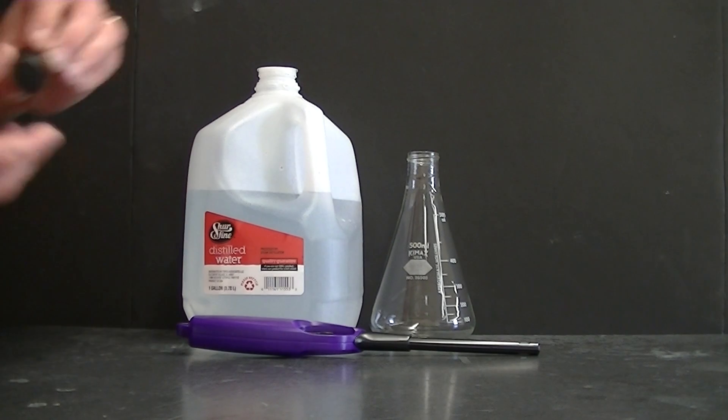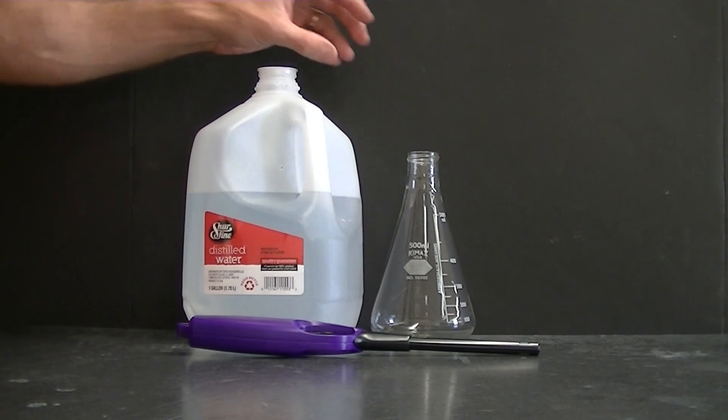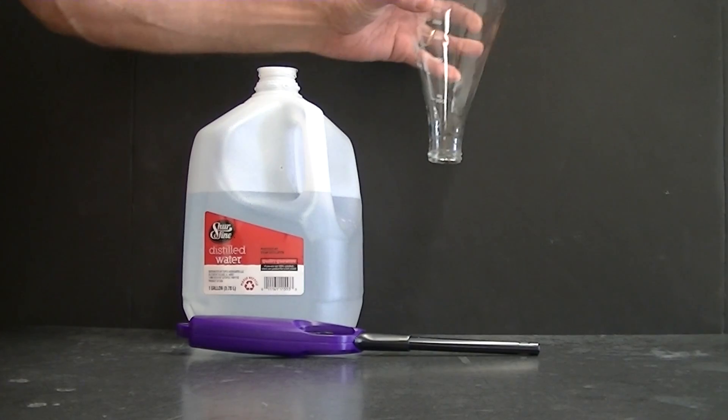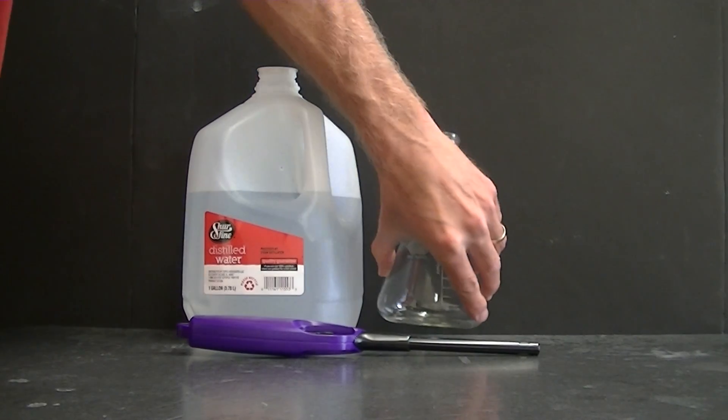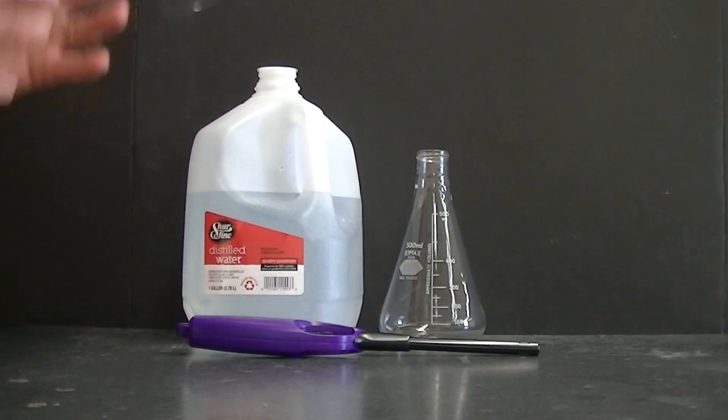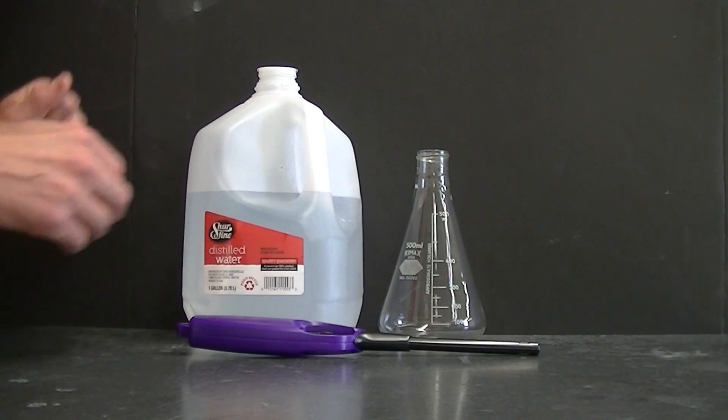And then when it's time to do the experiment, let out the lid, show it to the audience, and turn it upside down. And because the inside of the flask is coated, it's not pooled, and the liquid won't drip out.